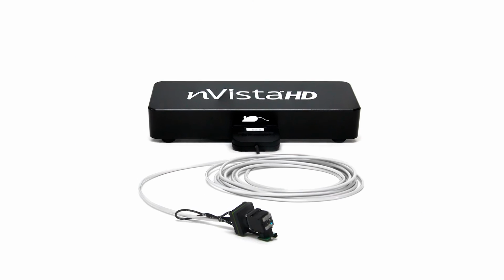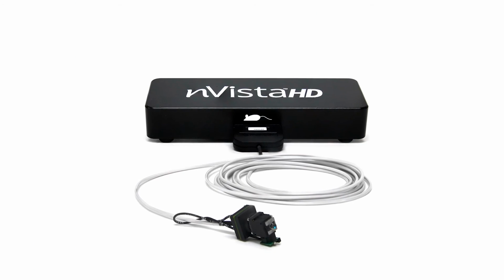One of the strategies that we're going to use to hopefully functionally dissect the action planning and action perception networks is to image cells on the basis of the areas that they project to. You can do this using viral targeting strategies. This is an advantage that you have when you're doing calcium imaging that you just really can't implement very effectively when you're doing, for example, tetrode recordings. So this is an approach that you can pull off very nicely using the Inscopix system and in vivo calcium imaging. That's very hard to do electrophysiologically.